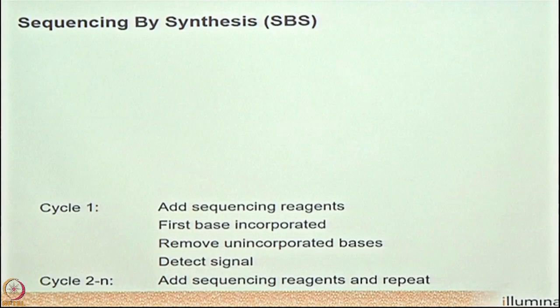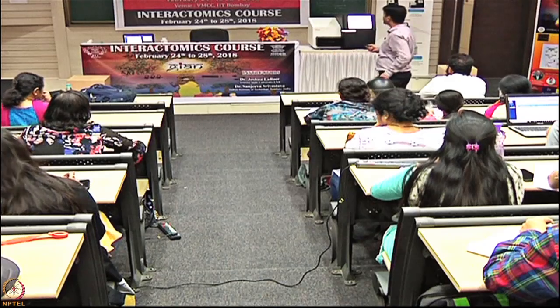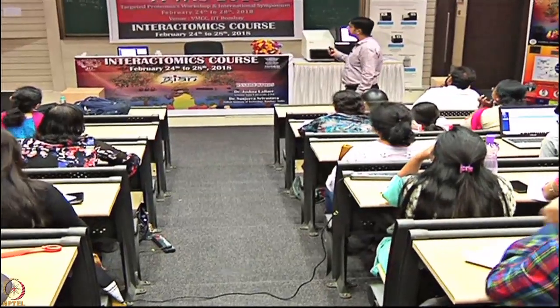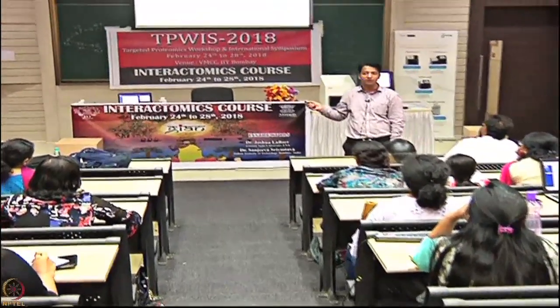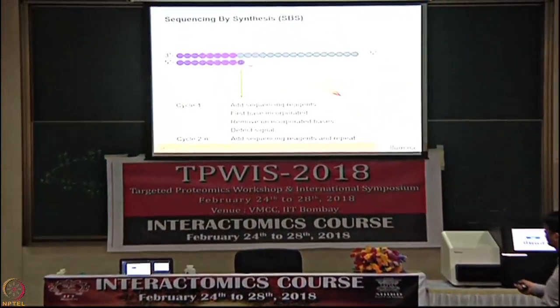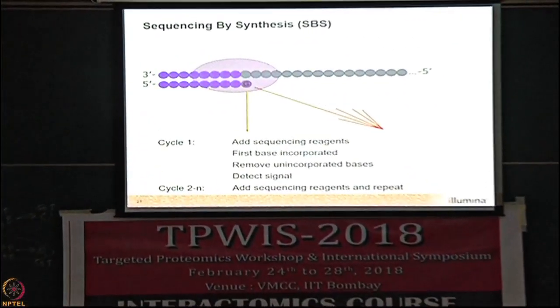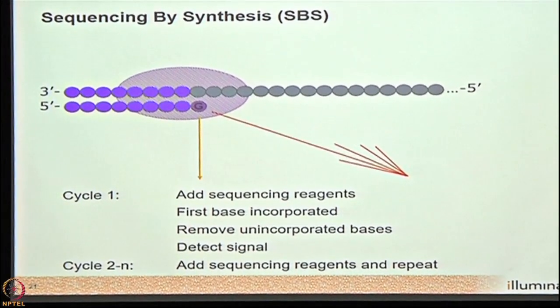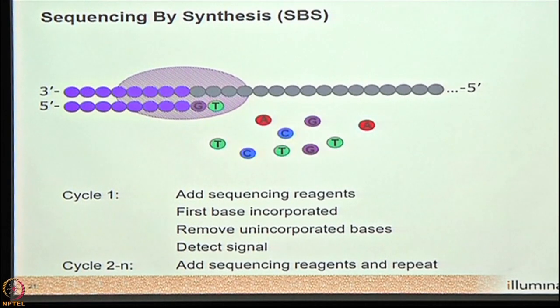With Illumina, we essentially mimic Sanger sequencing, just like the natural phenomenon. So we have 4 kinds of bases. Let's say there's your strand, and we have added a primer. You can see all these bases are labeled with a fluorophore. One at a time, one base will go and bind to the sequence. It will be detected just like Sanger. We'll wash away the unbound bases and then we are set to go for the next cycle. So there is direct detection of the bases. Let's say you are running a 300-cycle sample. So 300 bases will go and bind. This is your one fragment.